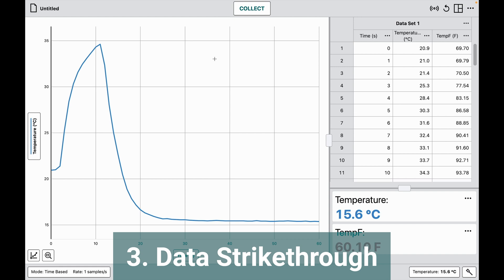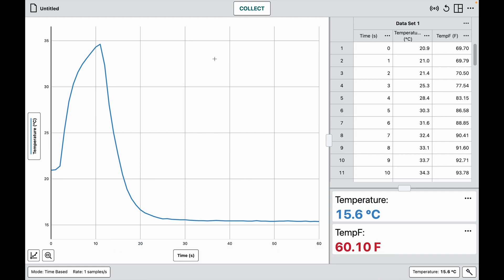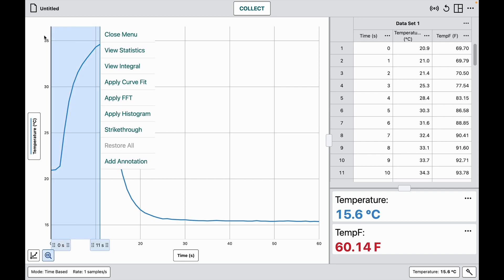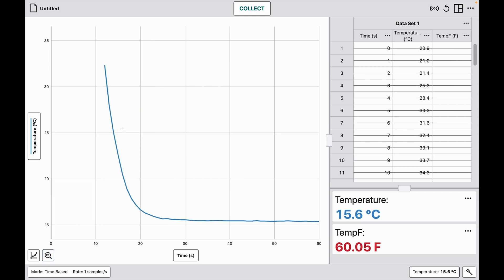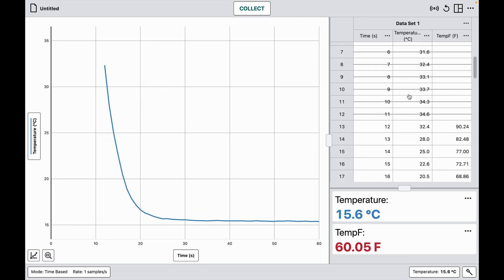Another feature is strike-through data. In this graph I have temperature plotted versus time with two very distinct regions: one where the probe was warming and one where it's cooling. I want to focus my analysis on just the cooling portion, so I highlight the region I want to remove and choose the strike-through option. The data table shows the struck values marked.